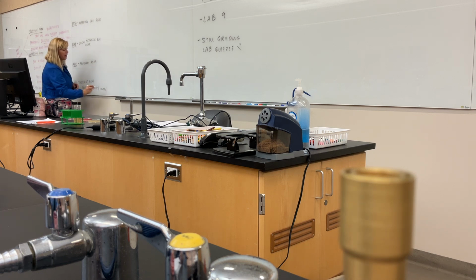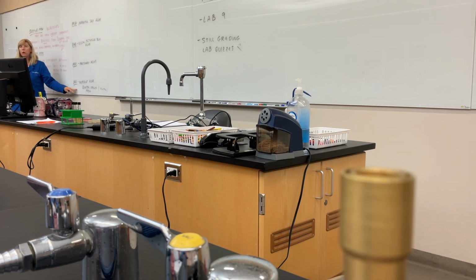Again, in a laboratory setting, we would always set up some sort of control, a general growth. Usually it's not nutrient agar, usually it's something like blood agar, that we can pick pathogens off pretty fast. Blood agar, we'll talk about that a little later, we'll actually have a lab that uses it. Blood agar is usually from sheep's blood, okay?